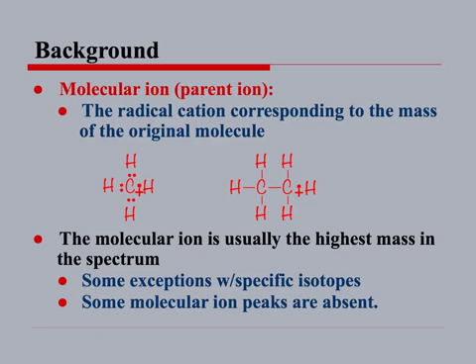But sometimes the molecular ion peaks are absent. They are not present all the time because they may not survive. They may break. All of the molecules break to smaller fragments, so you may not see the molecular ion.